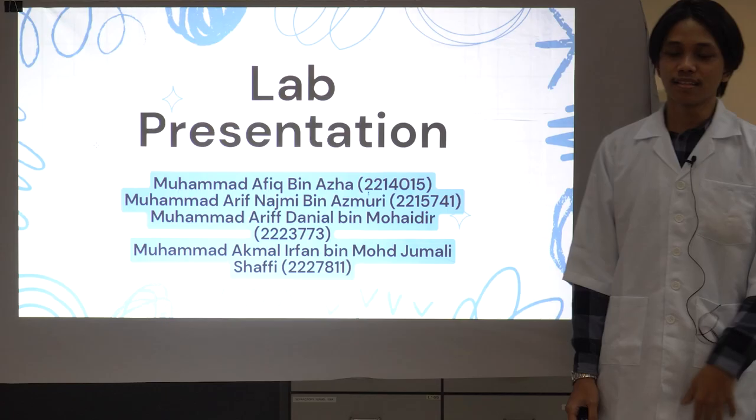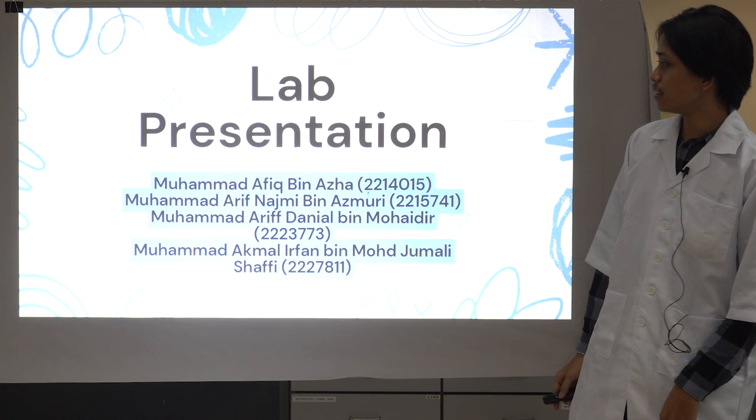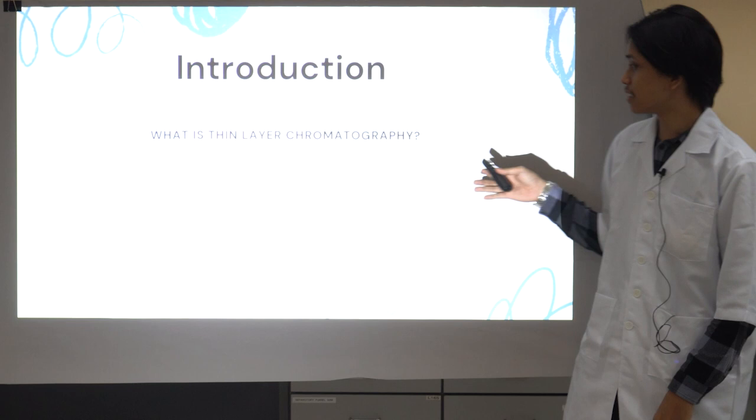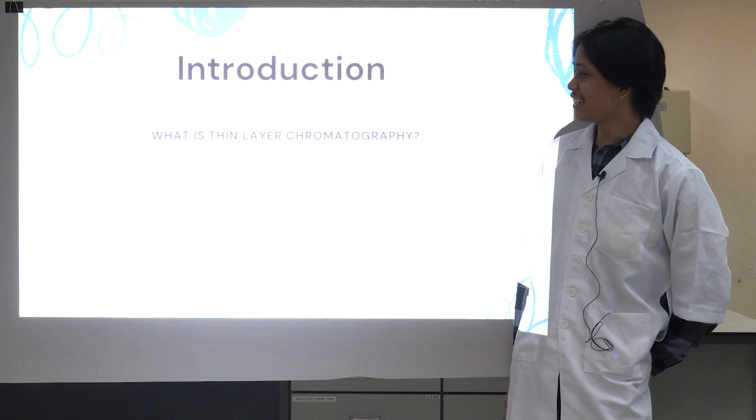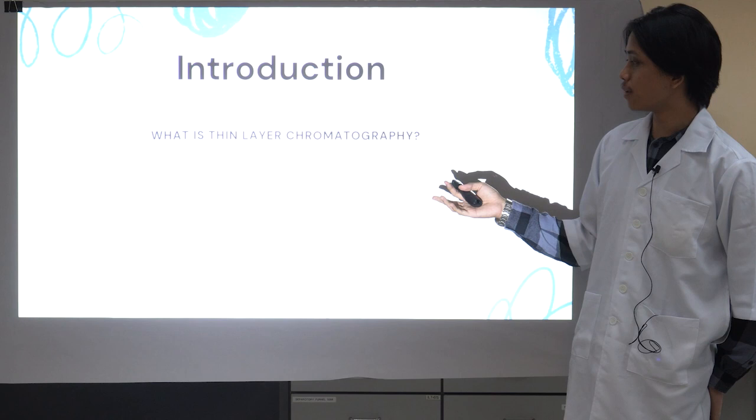Bismillahirrahmanirrahim. Assalamualaikum. Today, group 5 wants to present thin layer chromatography. I will introduce it. What is thin layer chromatography? Thin layer chromatography is a separation technique and an analysis of unknown compounds. For your information, scientists use thin layer chromatography to identify unknown compounds and determine the activity of the unknown compound.